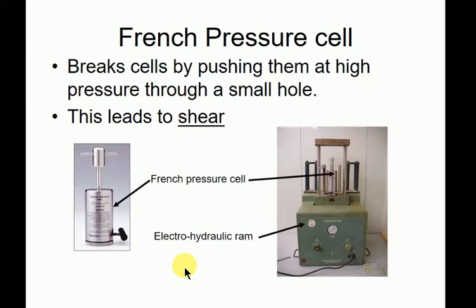So now you've got your cells inside here. This you've pre-cooled again, right? By the way, you don't want heat to be your enemy here. So you'll have pre-cooled this in a polystyrene box full of ice. You load your cells in, and this only usually takes about 30 mils of cells. And you don't want to be lazy and stick all your cells into 30 mils and load in a big gloopy paste. You might want to do 2 runs of this.